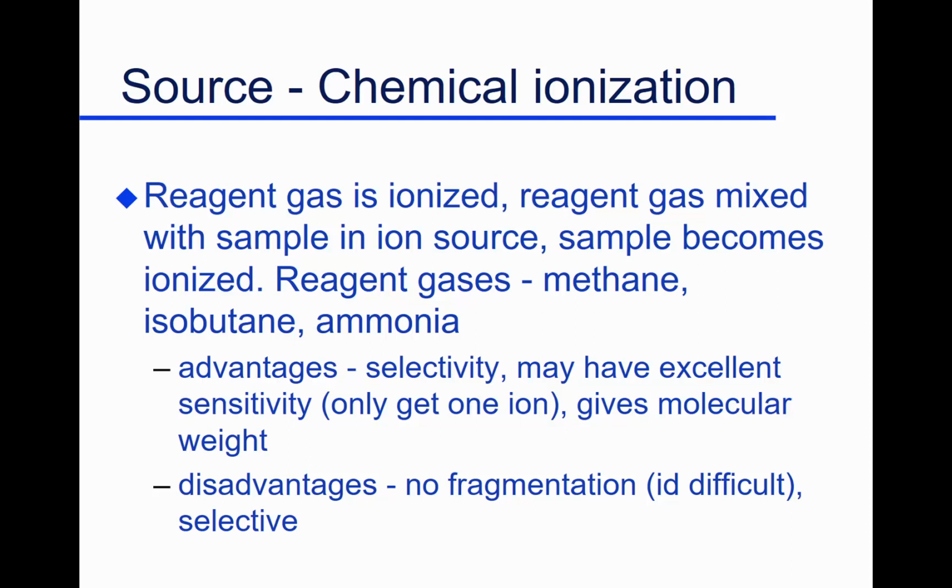We use this also in terms of a detector at the end of a gas chromatograph. If I've only got one ion or just a couple ions, they're going to be there in abundance. We'll have a lot of them. I haven't spread the charge out over many things. So I can set my mass spectrometer to maybe look at that 165. My mass spectrometer is going to be looking at one ion, monitoring throughout a run. And every time I see 165, I think of ephedrine.